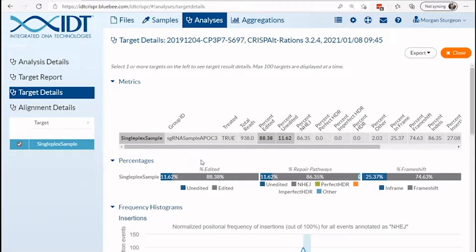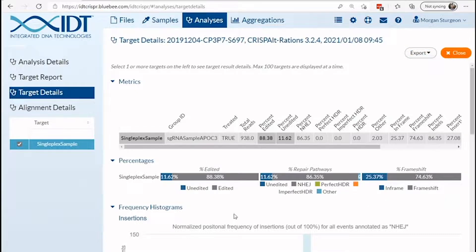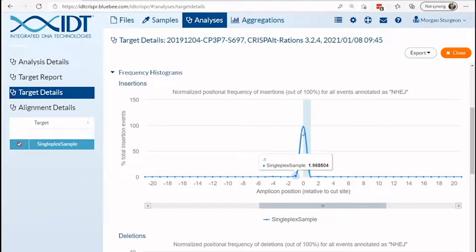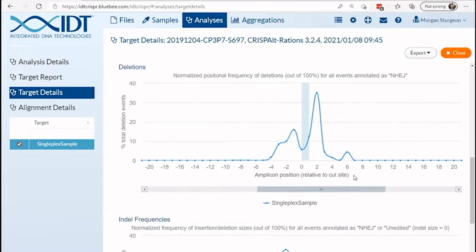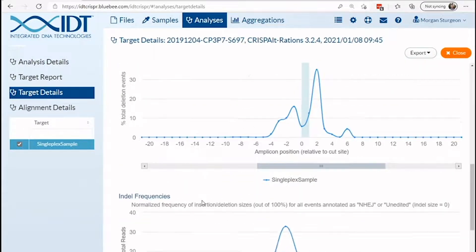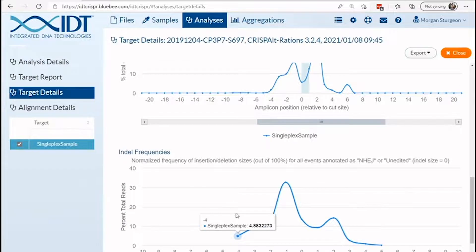This will contain graphics for the target amplified that can be easily exported using the button in the top right corner. From this page, you can find the frequency of editing, repair pathways used, and frame shifting events. Additionally, you can explore the position of insertion and deletion events that occurred in the sequence sample and the size of these events.